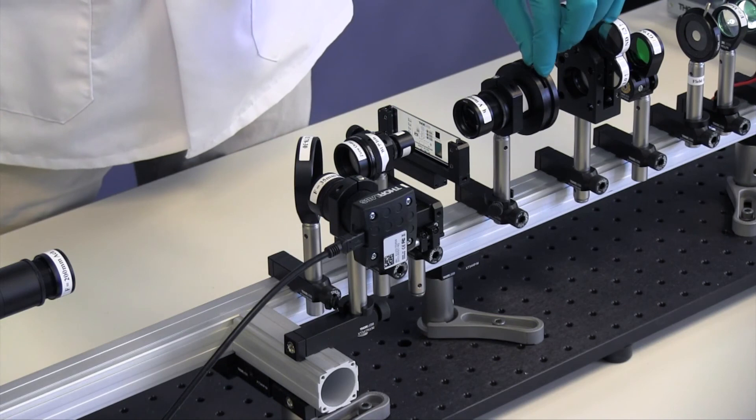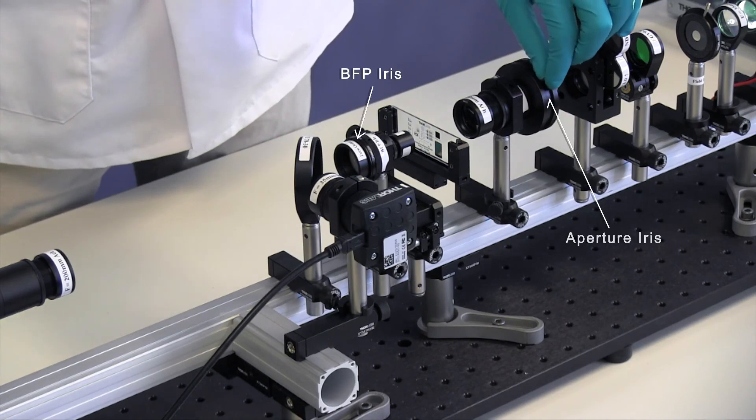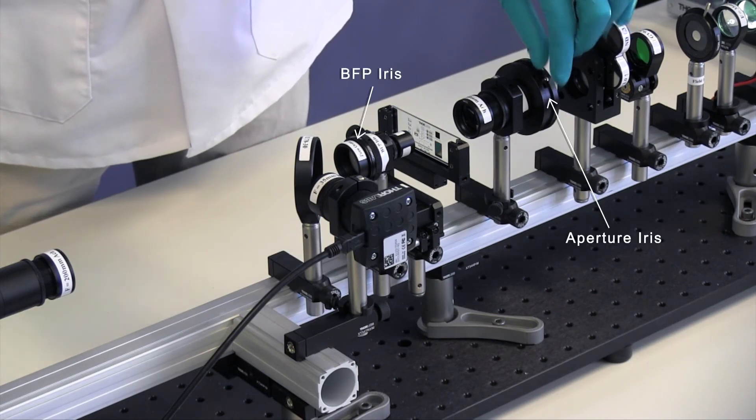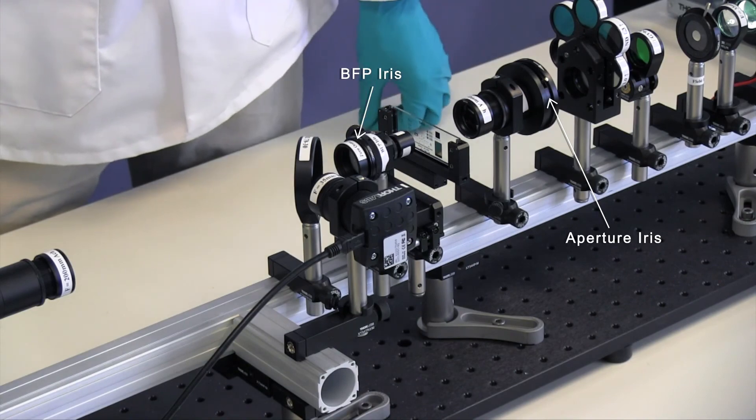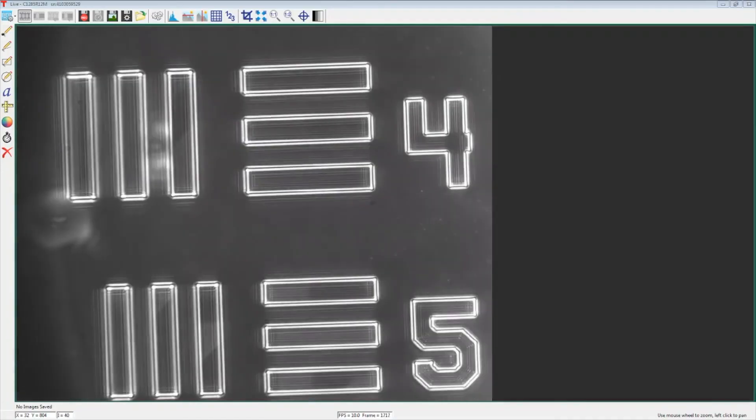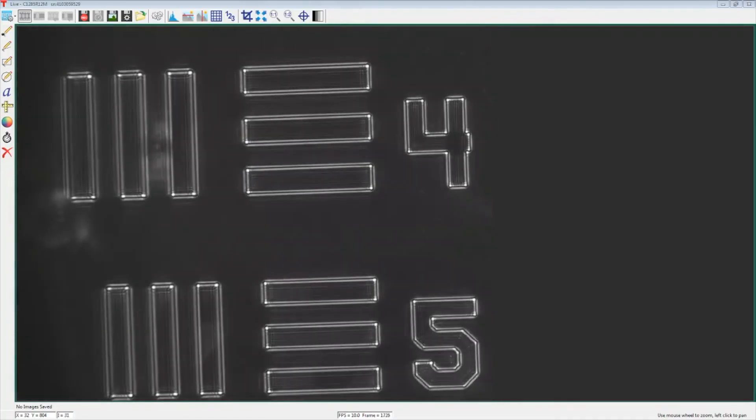Lastly, open the BFP iris and close the aperture iris until illumination is blocked by the zero order mask. Turn up the exposure on the sample camera until you can see a dark field image.